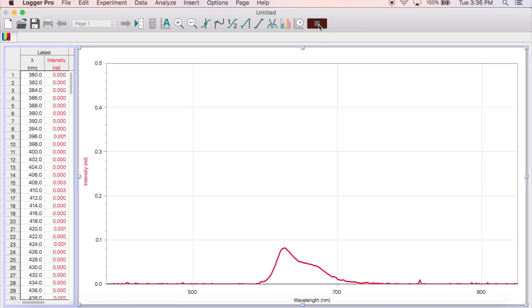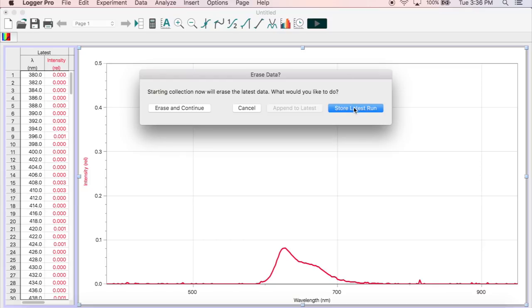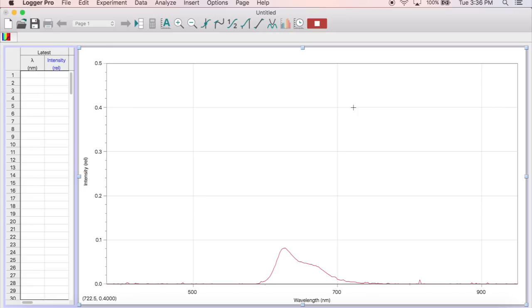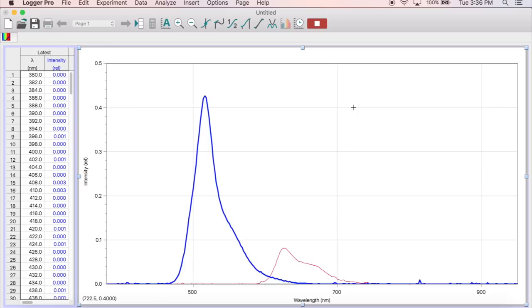You can also run multiple samples back to back. Switch out the vial in the sample compartment and click the green collect button again. Then click on store latest run to save the previous spectra and add another one onto the same graph.